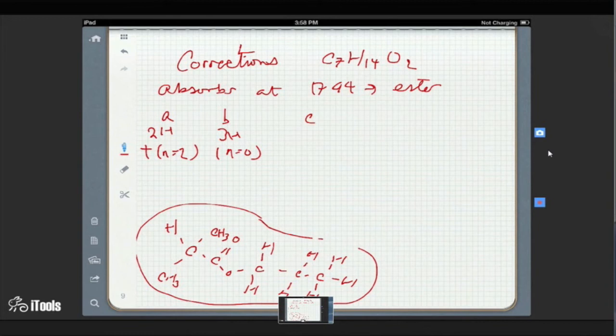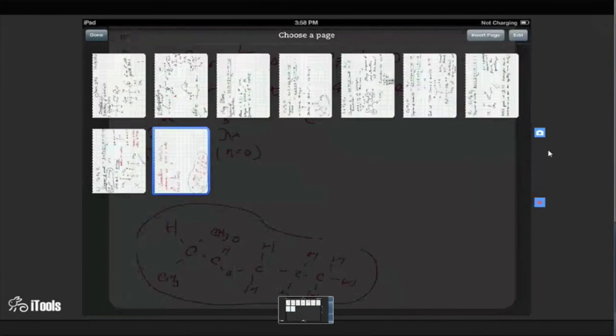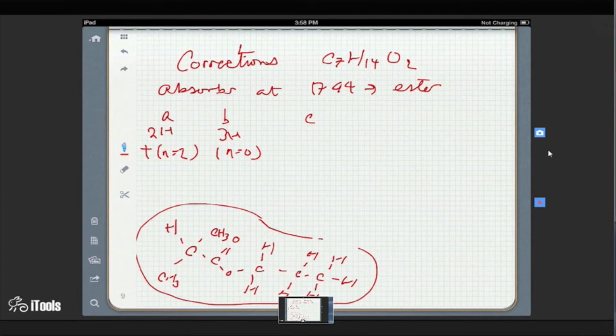That's the thing. This CH3 here, I don't think that should be at 2. It's shifted too far to the left, you're saying. Right. It is shifted too far to the left. There's something that's more definite though.